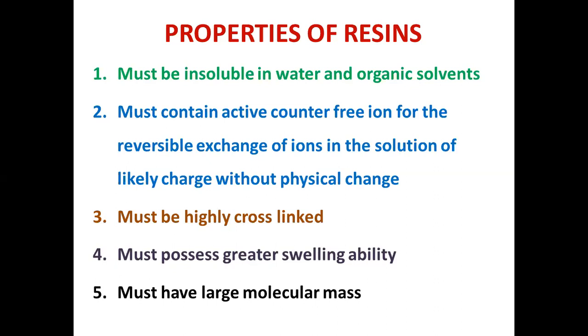Of course, these are polymeric in nature. They must have larger molecular mass. You cannot prepare a resin with the lowest molecular mass. The resins must have larger molecular mass, and consequently all these four properties are expected. So these are the properties of resins.